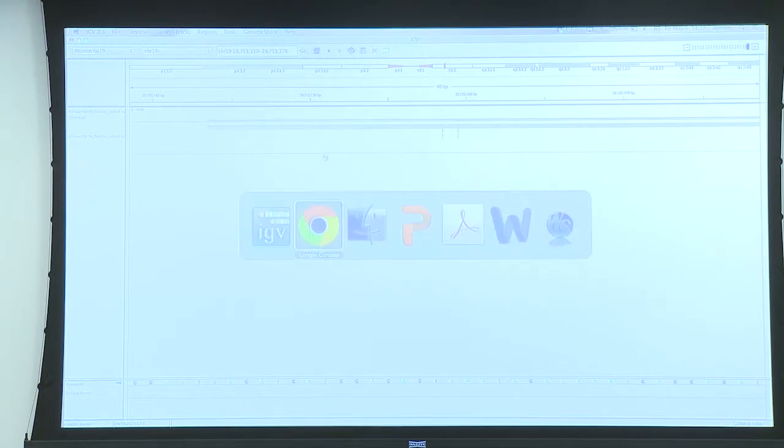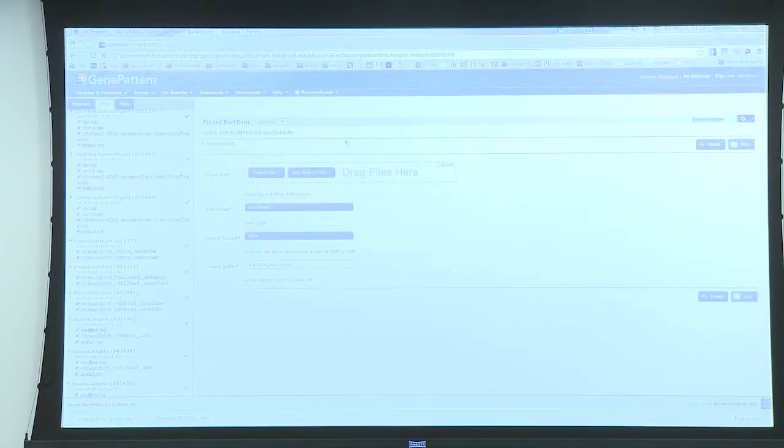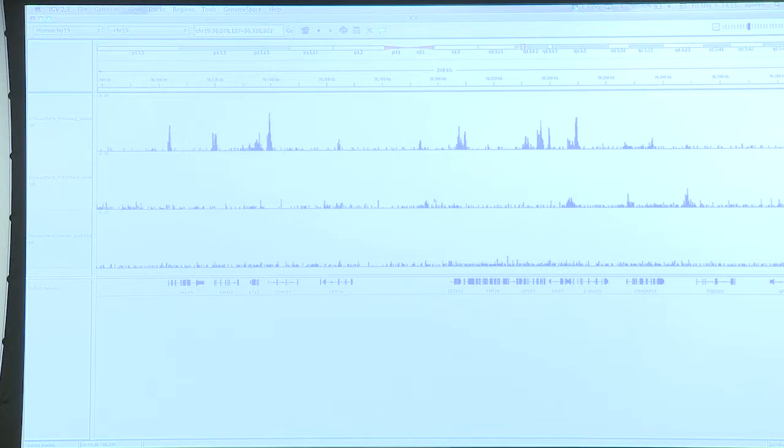So what should be the maximum number of reads in terms of having good data? This depends on your data, but that's a good question. It depends on whether it is ChIP sequencing for which epitope, if it's RNA sequencing and so on, and what the size of the genome of the model organism you're working with is. It varies: bacteria or viruses are small, and humans or even more complicated genomes are much larger, but it depends.